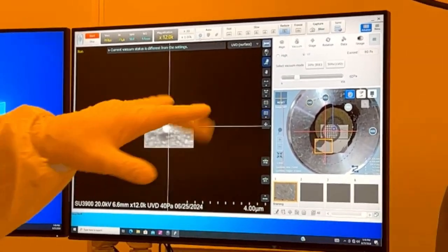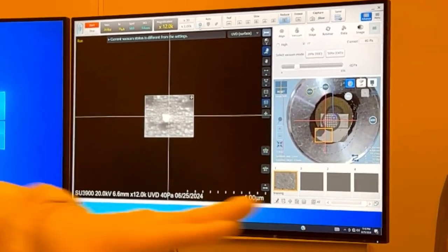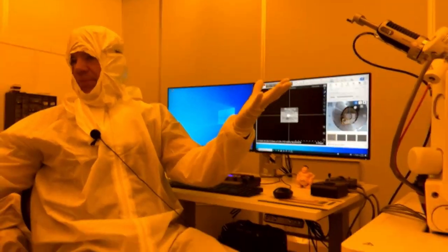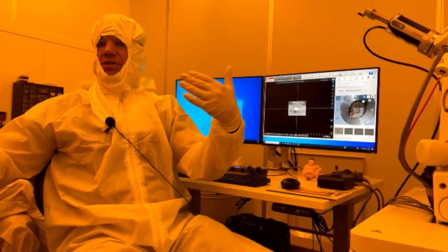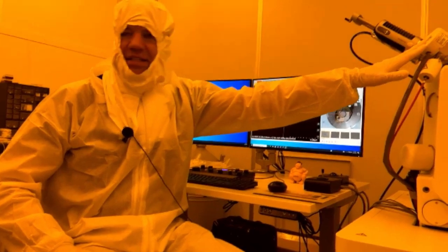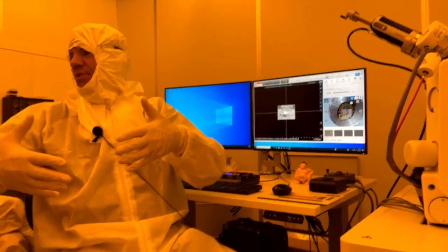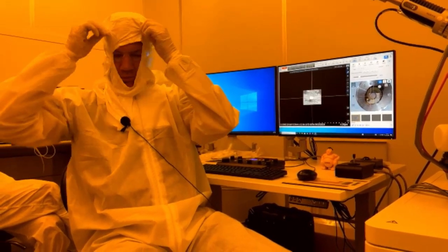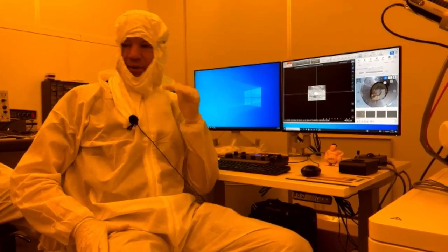What happens is someone figured out the gas that we're letting in the chamber right now, the secondaries are still coming off our sample. The secondaries interact with that gas and produce ultraviolet light. So then we use this detector to give us a secondary image from that ultraviolet light. Who figured that out? I don't know, smarter than me.